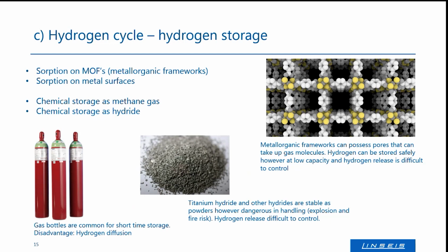In thermal analysis, the storage in gas bottles and tanks is more or less for short time and not interesting, because we do not investigate the gas phase and we do not investigate these bottles. What's more interesting for us and what we did in the past is sorption and desorption processes on zeolite structures, so-called metalloorganic frameworks or metal surfaces. We also did some experiments with customers that were working in hydrogen storage as ammonia or as methane gas. However, this is also gas phase analysis, which is usually not that much a topic in thermal analysis.